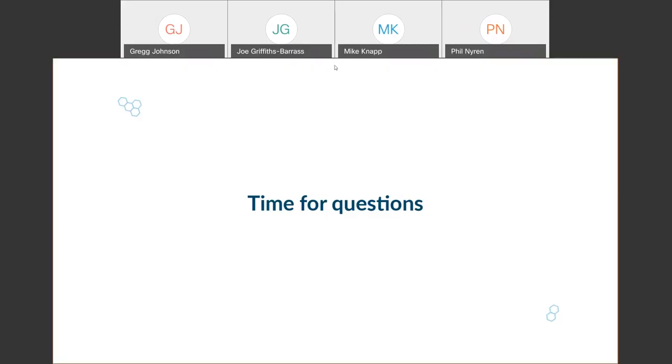Yeah, I can answer that question. I think Greg might have mentioned this in an earlier slide, but we have pump drives in the LS and IP families, and now in the Reglo family, that have the ability to directly connect a leak detector, and those are the pumps that have the open head sensor capability specifically. And that leak detector can be placed directly underneath the pump head, or it can be placed elsewhere in the fluid path. So let's say, for example, you're running flow through a capsule filter or some other kind of filter, or you have a connection that you're a little bit concerned about for whatever reason.